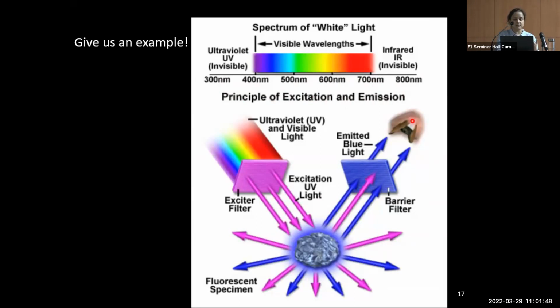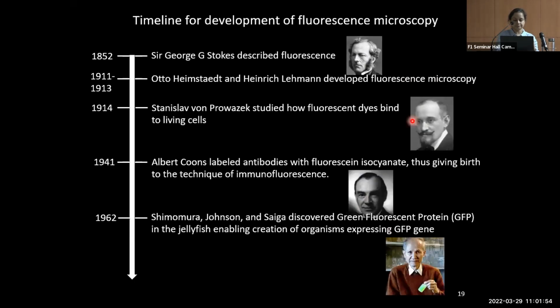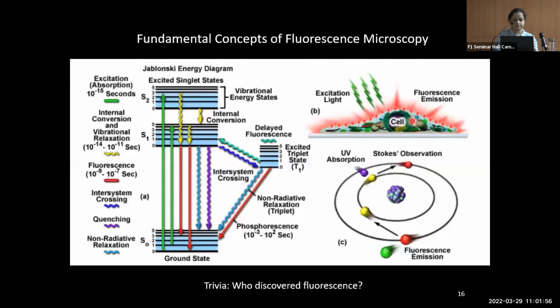Since we spoke about wavelength, that is 300 nm to 800 nm. What is fluorescence? Fluorescence is an emission which is happening because of... just focus on this diagram. These yellow balls that you see here are basically electrons. A fluorescent molecule absorbs photons from the UV light. UV light is shining, they absorb photons and they emit.